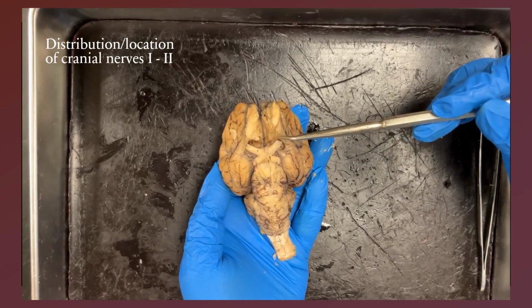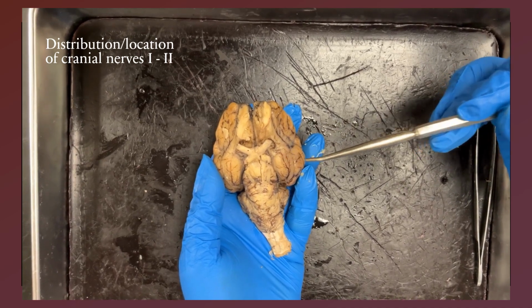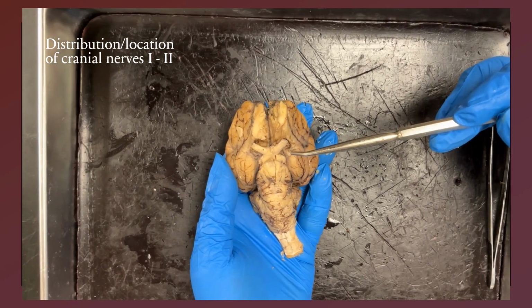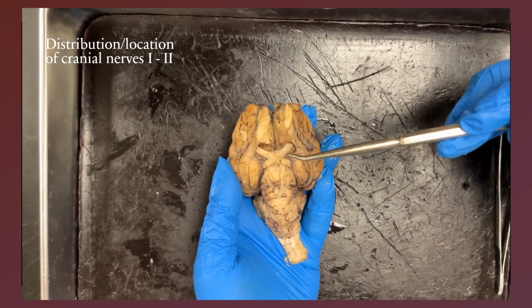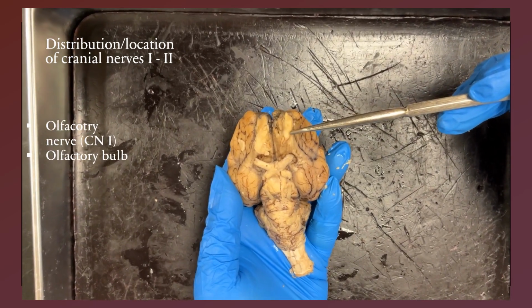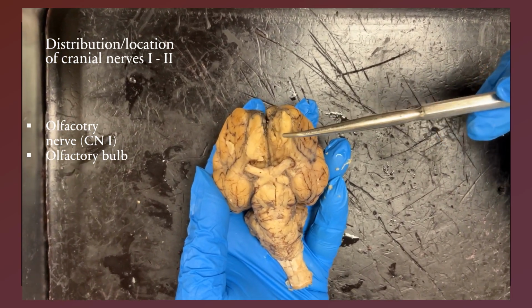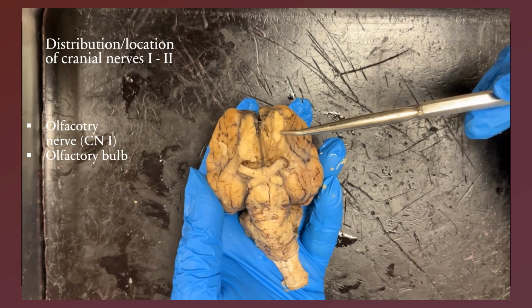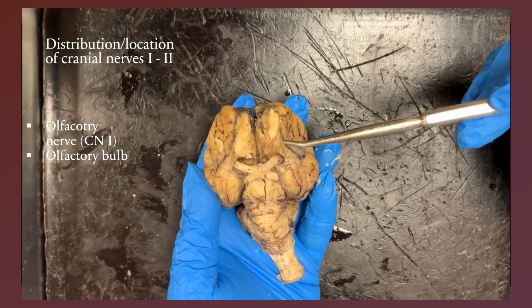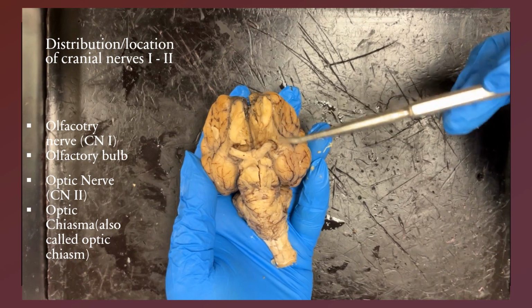Now for this last part, we will look at a few cranial nerves. As you know, cranial nerves originate from the brain. There are 12 pairs of cranial nerves, and they are always paired because there is distribution on each side, right and left. Starting from cranial nerve 1, the olfactory nerve. For sheep, we will see a very distinct structure. These are called the olfactory bulbs, which are much more prominent in sheep because, for their survival, the olfactory nerve is associated with the sense of smell.